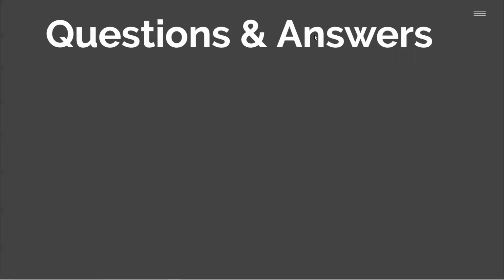All right, next question. I'm having errors creating my account for Infinite Toolbox in forums. Is this related to my software? So I do see there's a second person who says that they're having that problem too. So I know that we have a lot of people that were able to create accounts on the forums after this webinar series started. So it's not failing for everyone. So it is an issue with your system, but that doesn't mean we can't fix it.